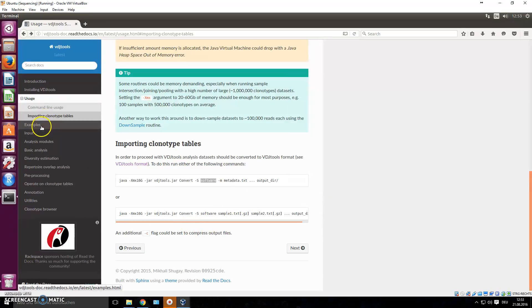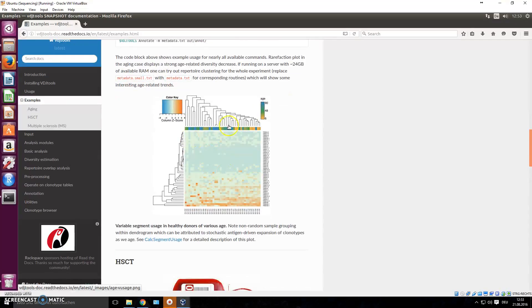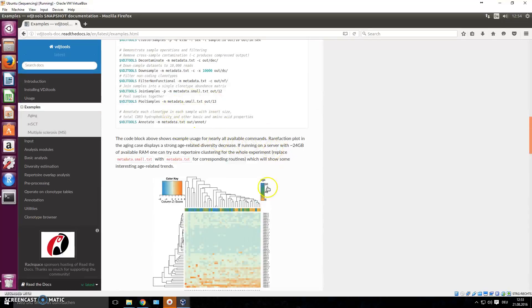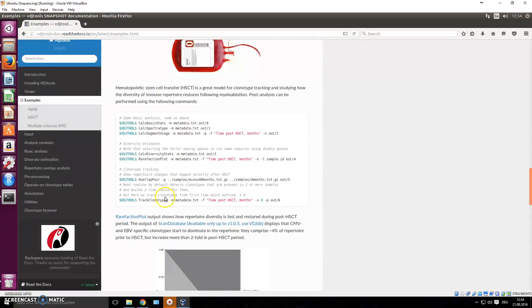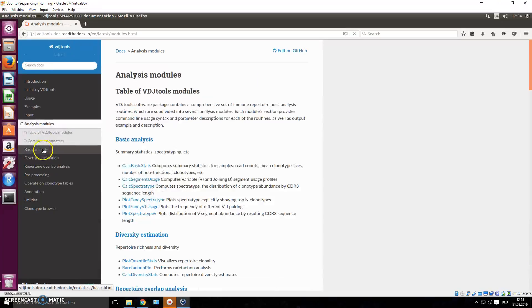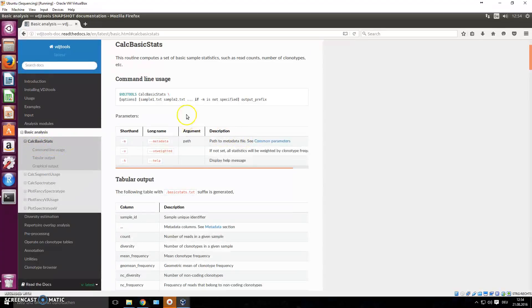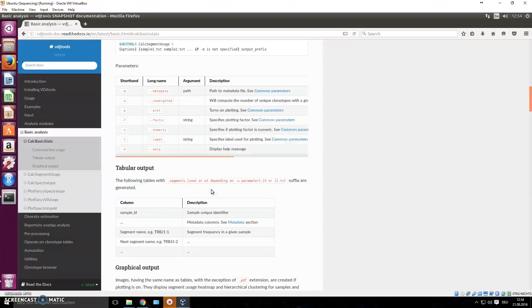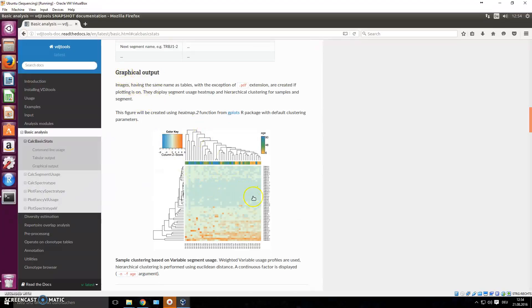Now the files are in the right format. We go to examples to see what different analyses are available — there are different examples for different types of studies. We're going to analyze our own data rather than their examples, so we click on 'Basic Analysis'. We can click on 'Basic Statistics' that we can calculate.